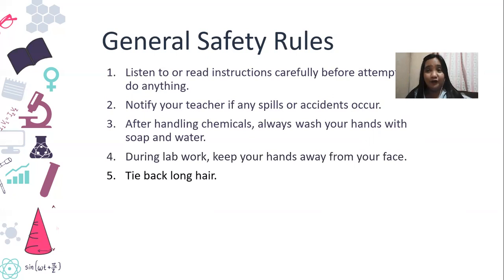Okay, tie back long hair. So if you have long hair like me, please put it in a ponytail. Why? When you're bending over and you have your hair down, and we have an experiment using a Bunsen burner or a heating experiment, your hair might catch fire, and that won't be really nice.